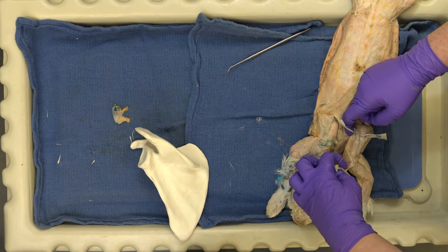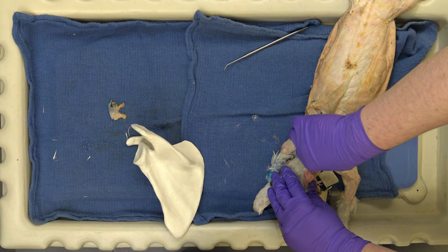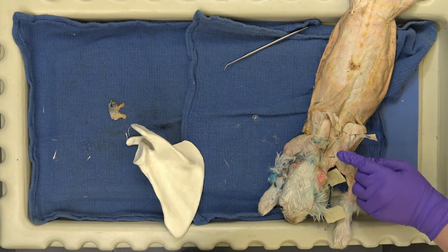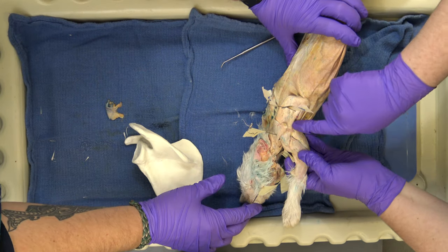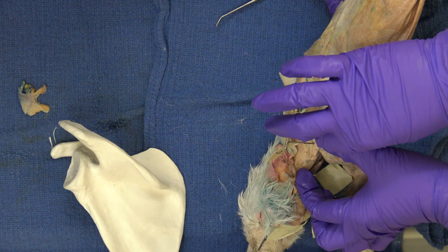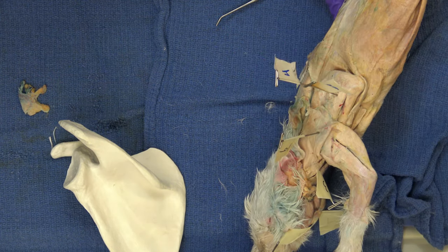Now we have the acromiotrapezius — I've detached it a little bit so we can better see the supraspinatus. The acromiotrapezius, one of your trapezius trap muscles — that is number six on the list. It is actually inserting on the acromion process of the scapula, that's why it's called the acromiotrapezius. It's one of your traps, and these little triangular muscles elevate the arm. So there is the acromiotrapezius.